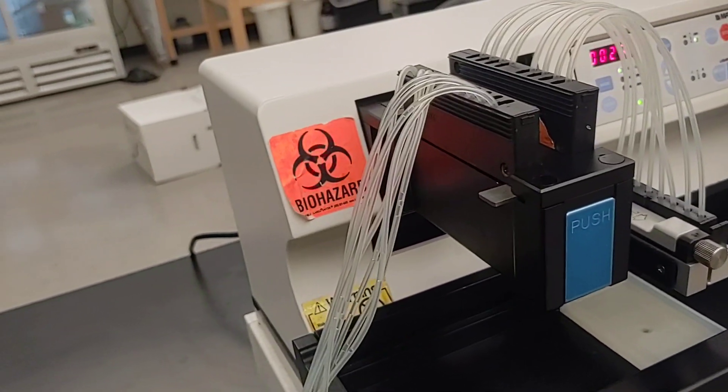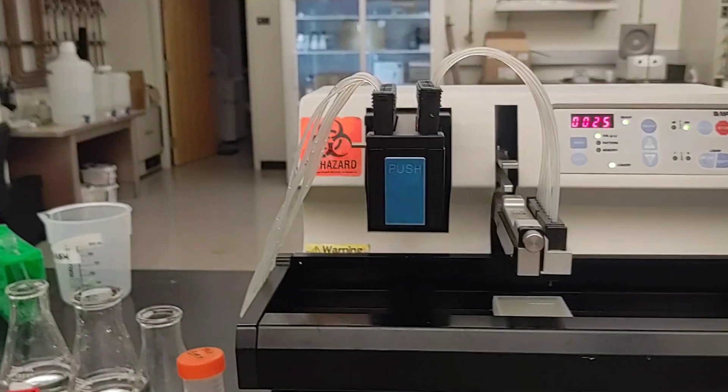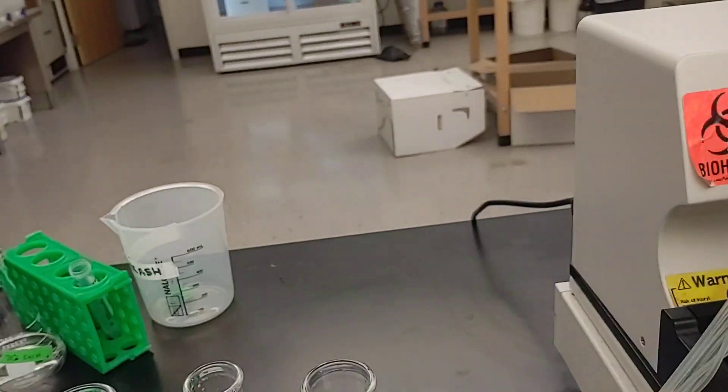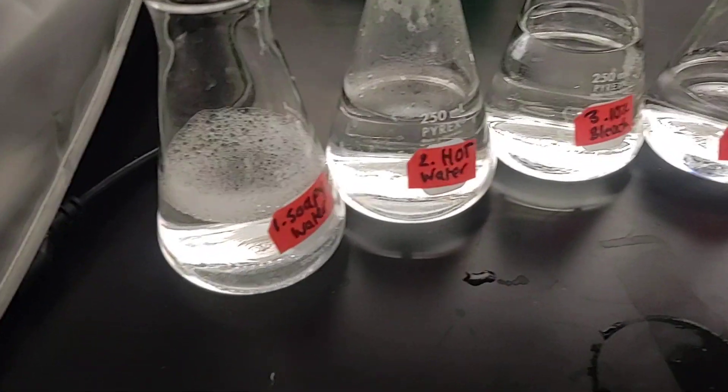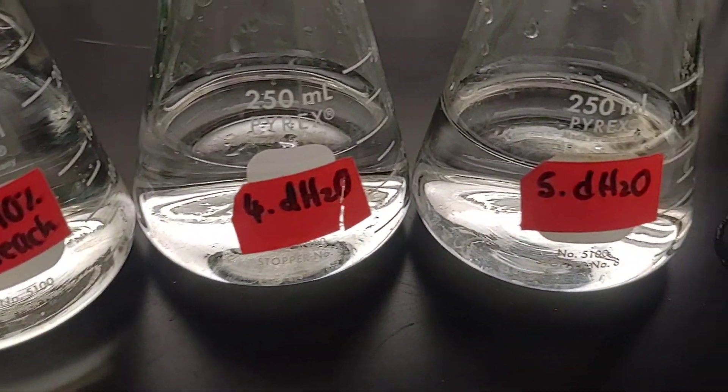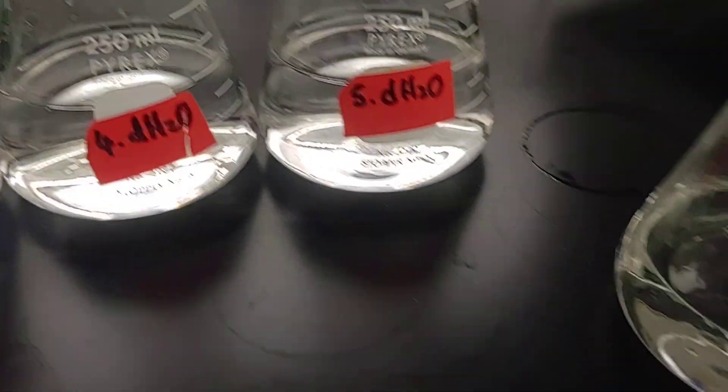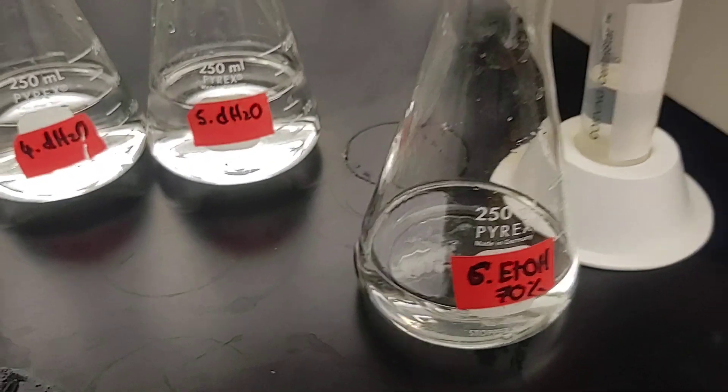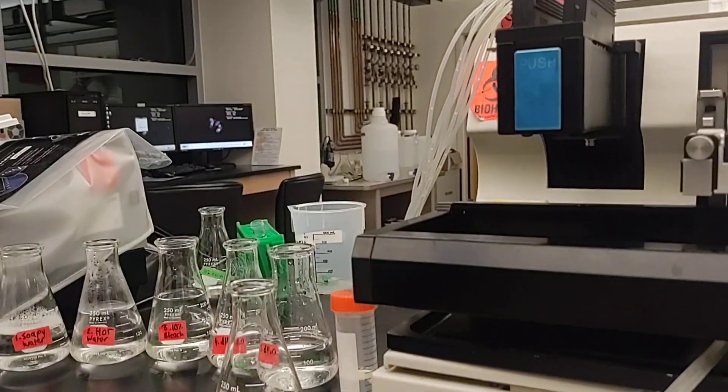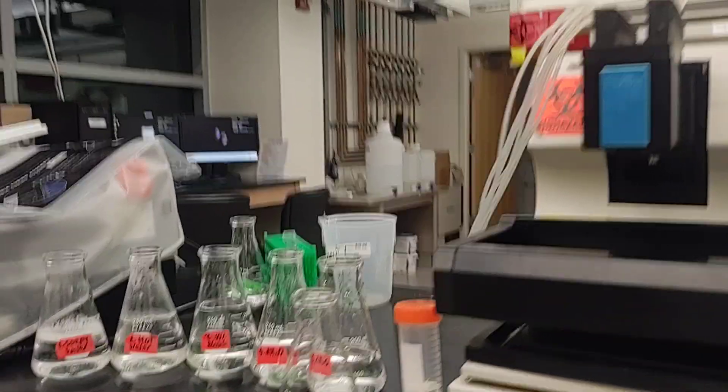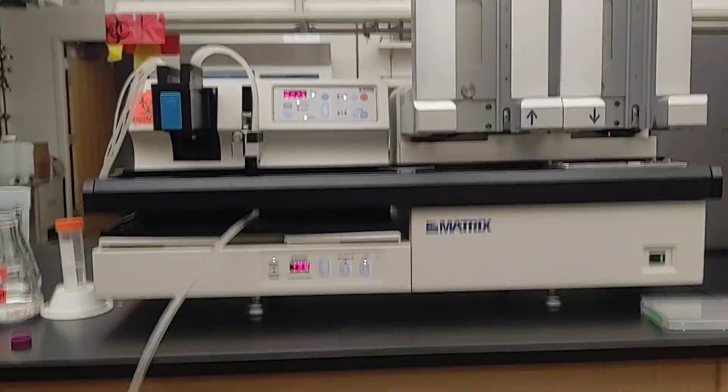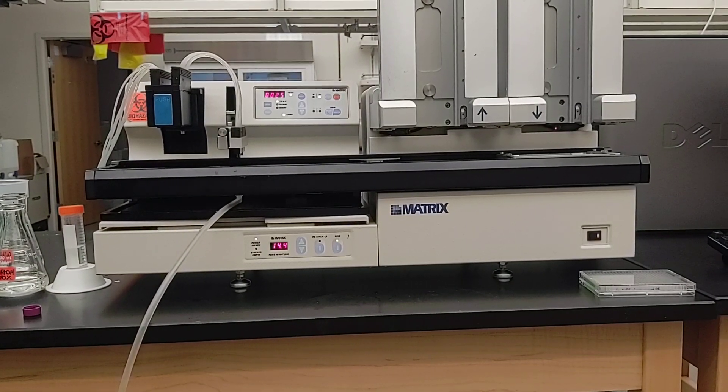And then normally you would have a sequence of solutions for washing the cassette. I usually do soapy water, hot water, bleach, two rounds of deionized water, and then ethanol. And I'll show you how to do that.